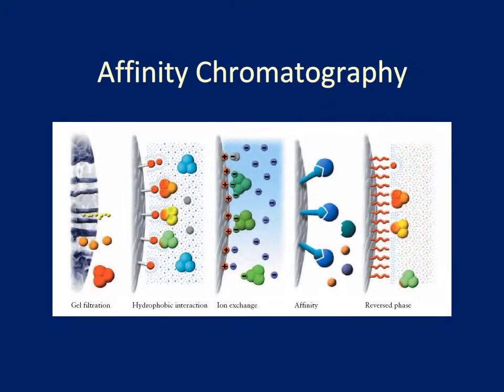Hello, this is a lecture for Affinity Chromatography. We've recently talked about ion exchange and gel filtration chromatographies, and this is the third installment with Affinity Chromatography.